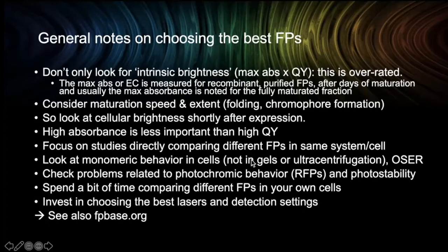This is nice, but typically the concentrations are much lower than found in cells. And then you will find that they are monomeric, but not strictly monomeric per se in cells in these systems. So this OSER assay is really, I think, the standard right now.